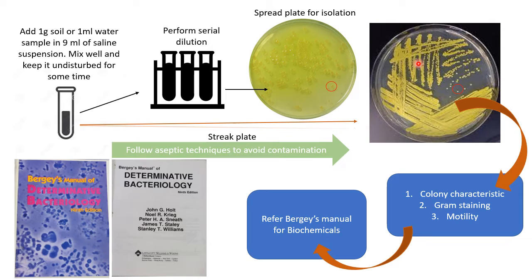But in the case of the spread plate technique, where you are spreading using a glass spreader and colonies are growing randomly here and there, it is difficult to identify the contamination. So do follow aseptic techniques and try to avoid contamination.